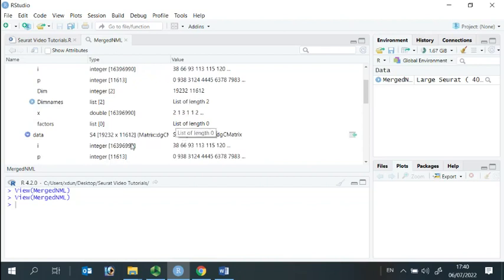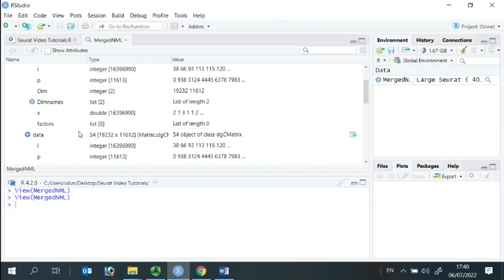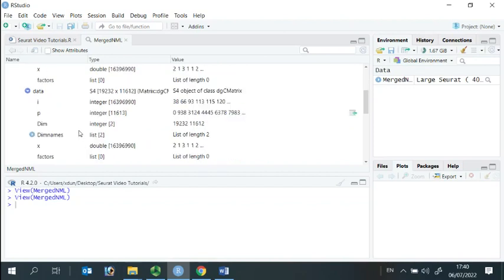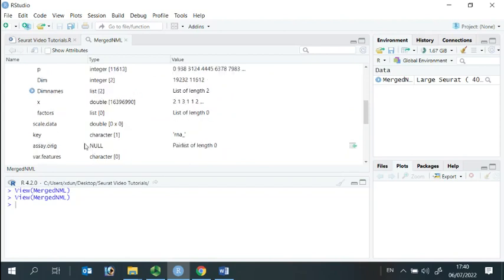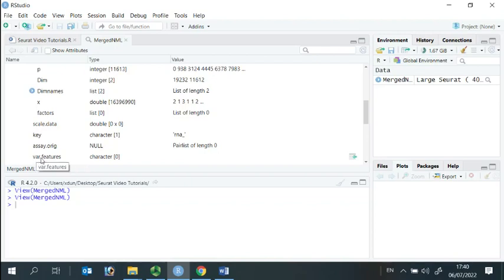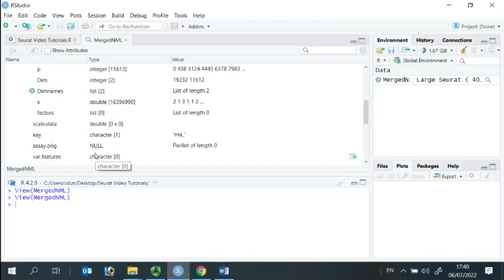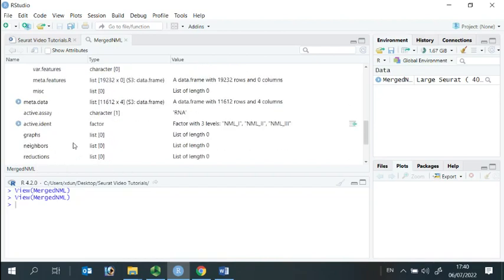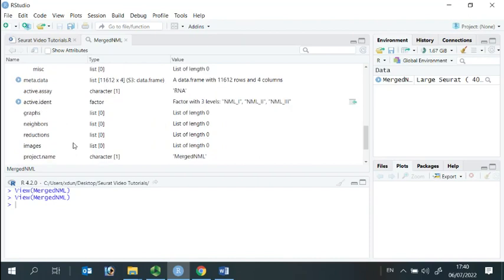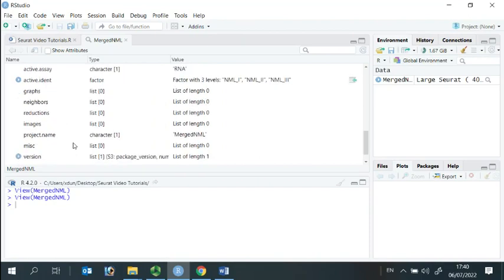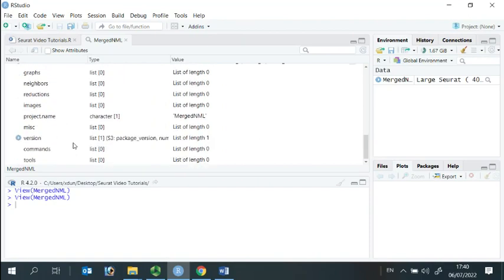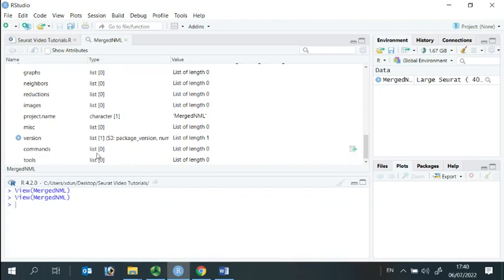We store the scaled data in scaled data, and we store the variable features in var.features. We also store each command that we performed in the commands list. At the moment, the list is zero.